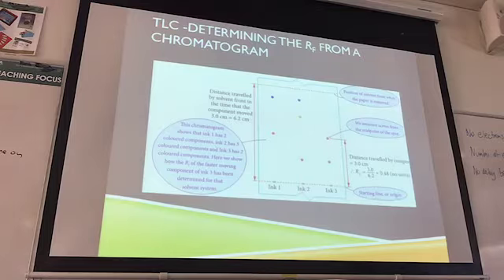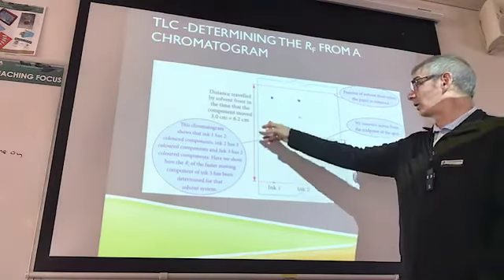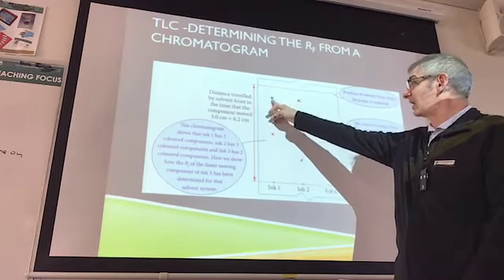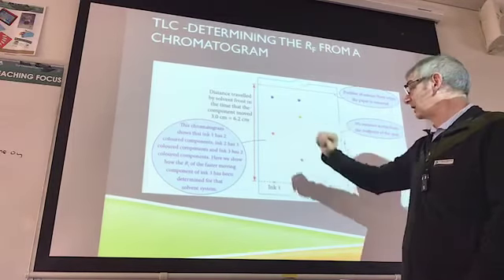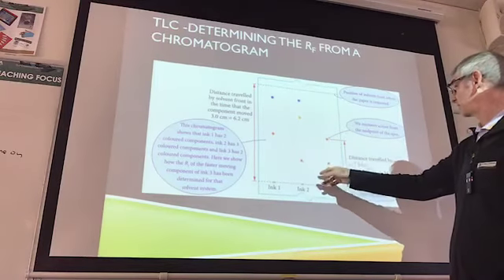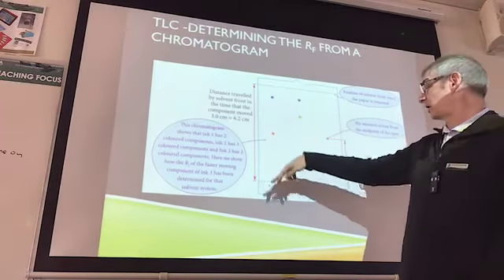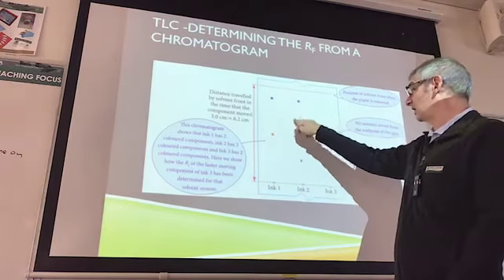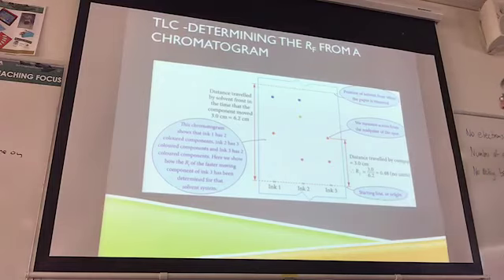So in this case, ink 1 has got orange and a blue dot up here, so we can see that this blue dot would be the same substance in ink 1 and ink 2. Ink 2 has got the pink dot down the bottom, they'll be the same, and then the orange one between ink 1 and ink 3 will be the same, and ink 2 is unique in that it's got the yellow dot as well.